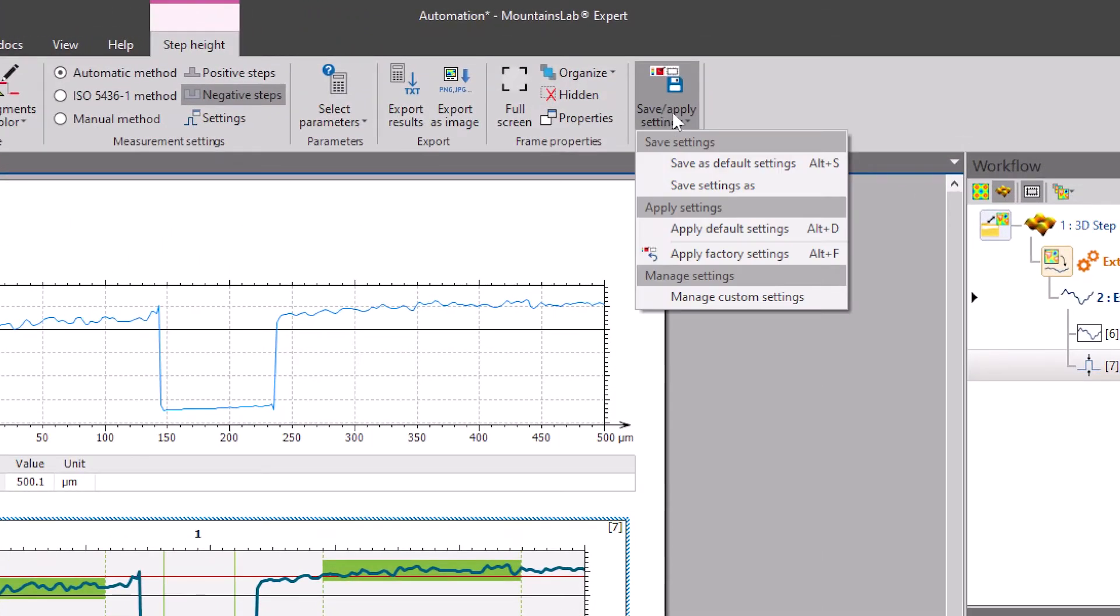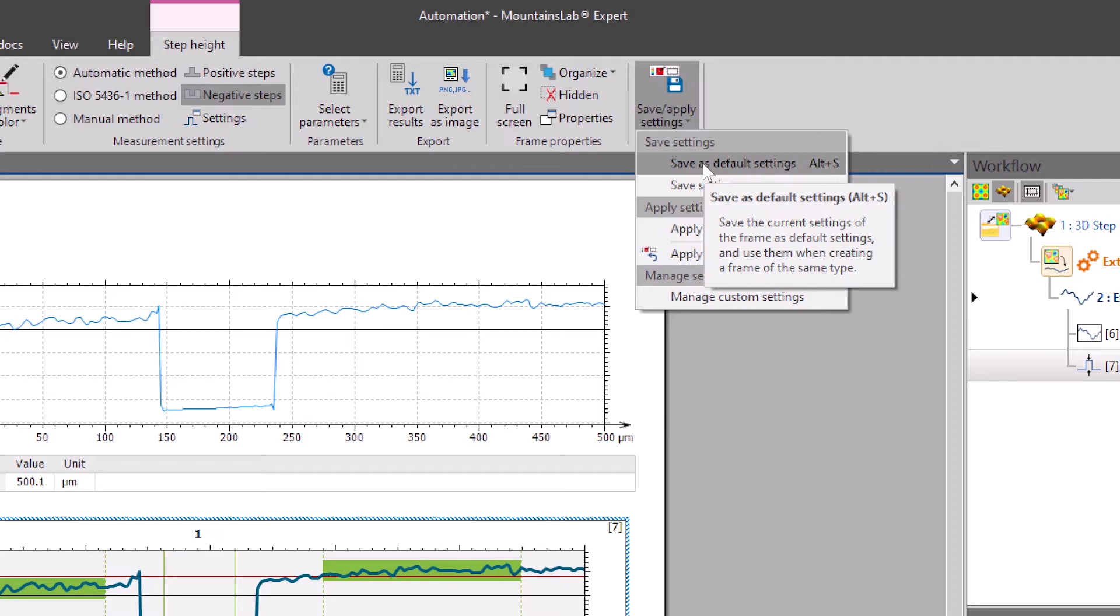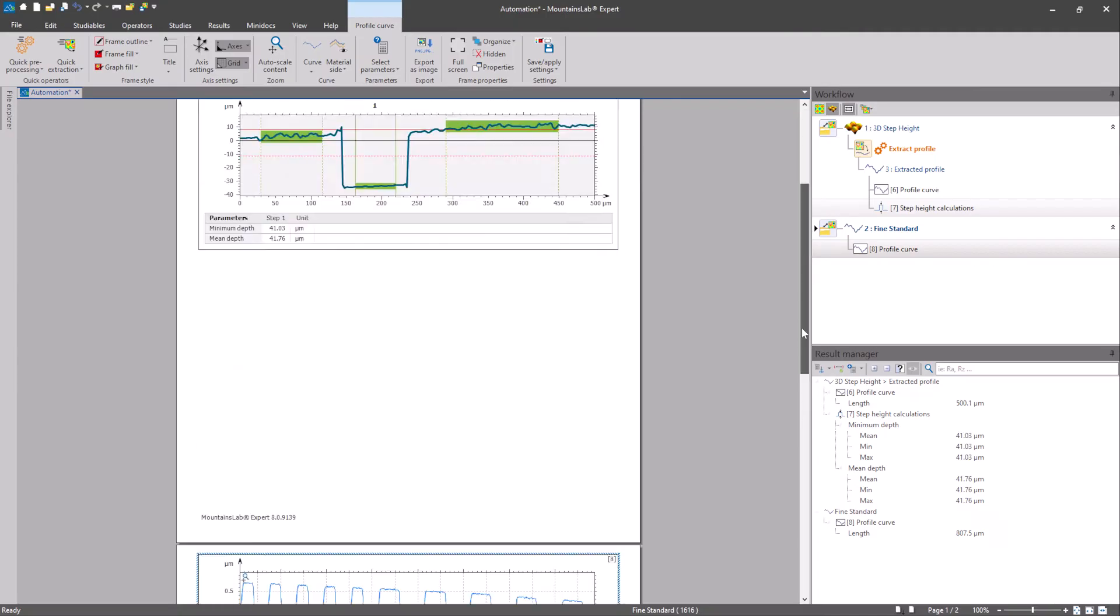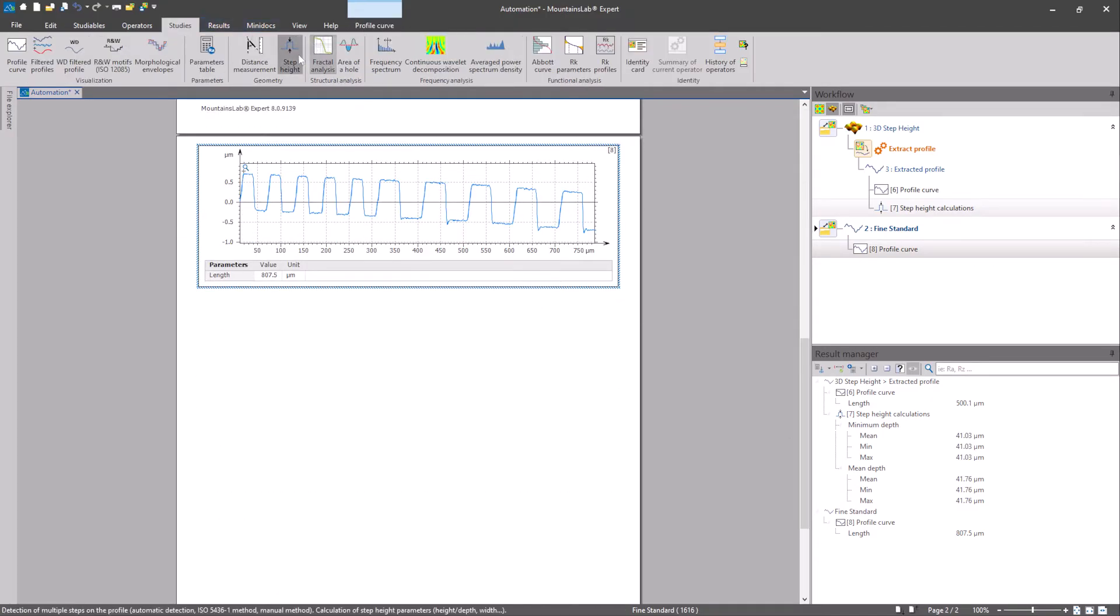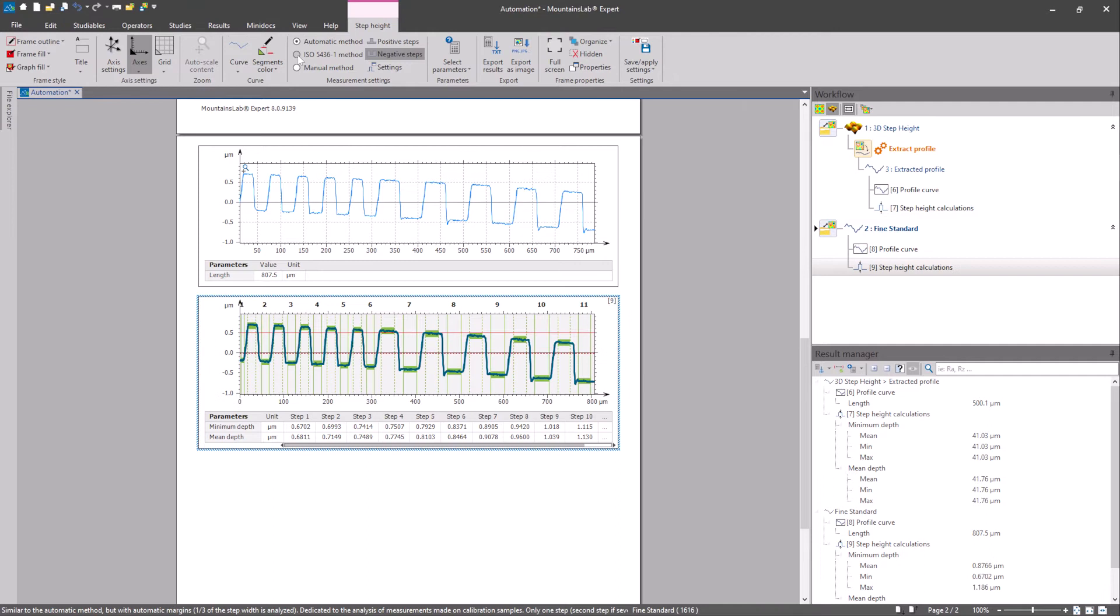Then I simply save my settings by clicking on the Save Settings button and any further step height study that I carry out is automatically formatted the way I want.